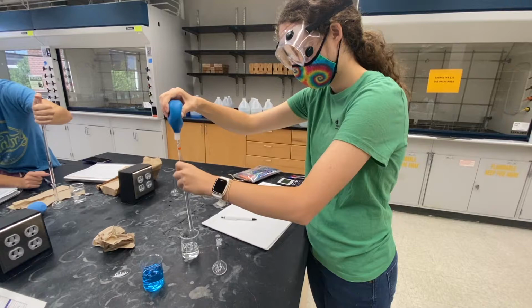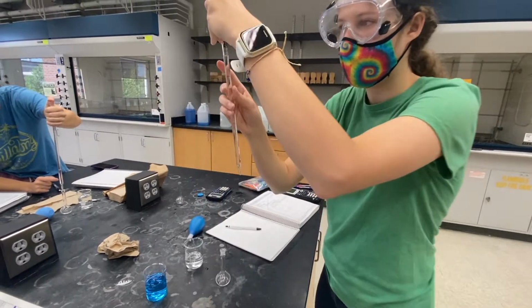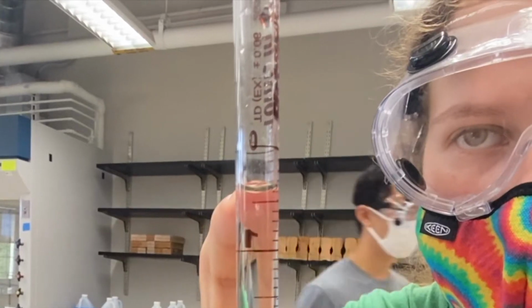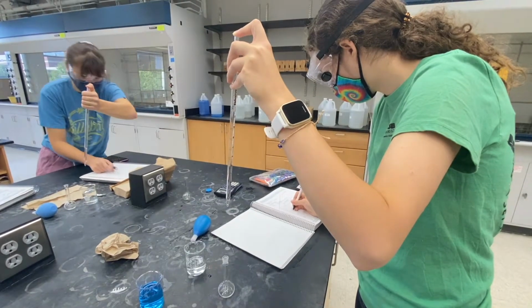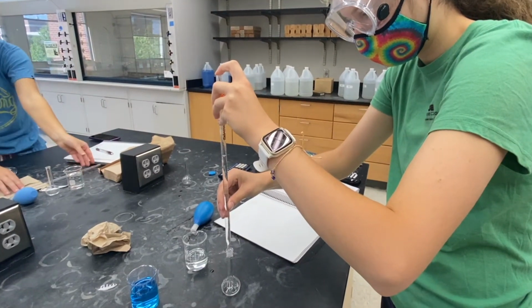Before starting the dilution, we pour the stock solution from its bottle into this beaker. Before transferring the solution to the volumetric flask, we read the initial volume. Here, the initial volume is 7.9 milliliters.